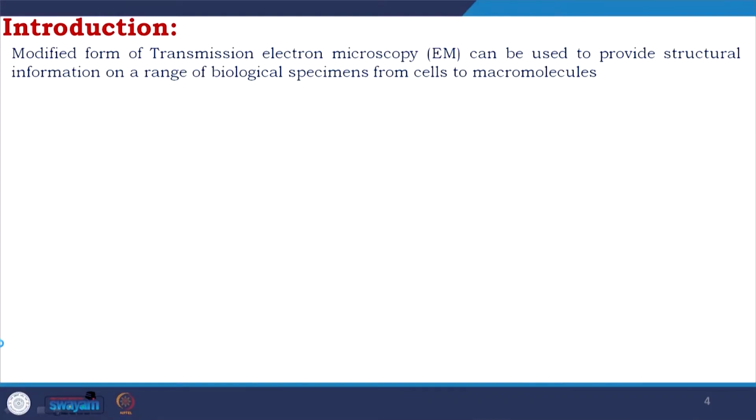It could also be used for getting the metabolic profile, and there are many uses as we talked about. Here also in cryo-electron microscopy, you could get the details of cells and relatively larger assemblies. Even in macromolecules, cryo-electron microscopy is not good for small proteins, it is good for bigger assemblies. We will talk about them.